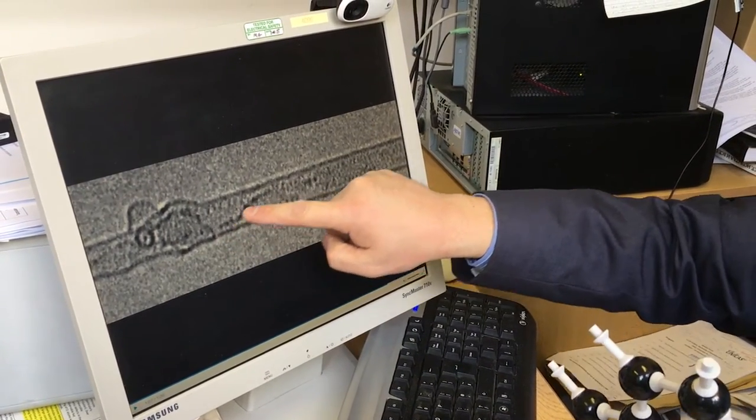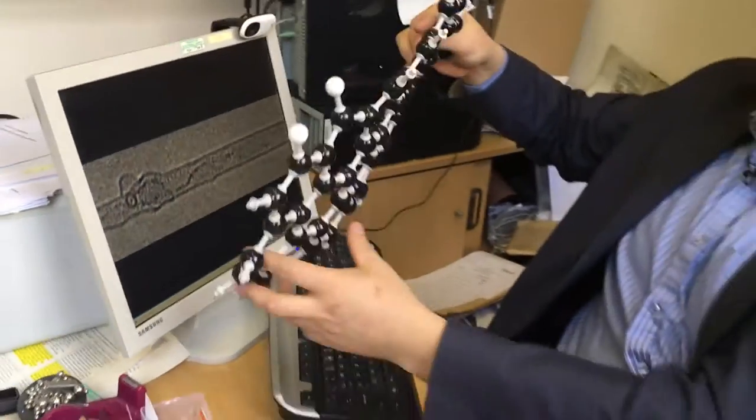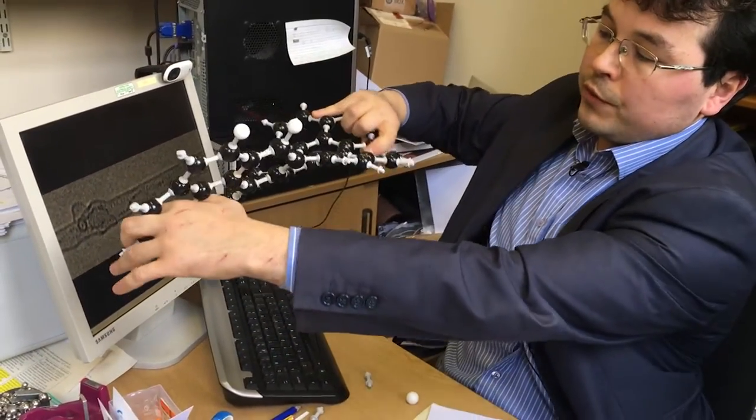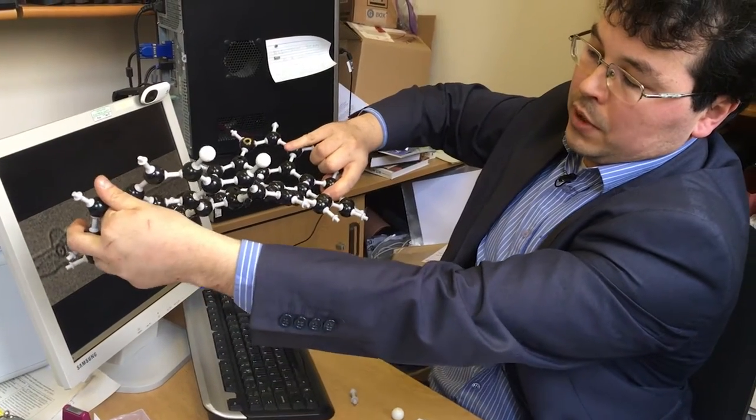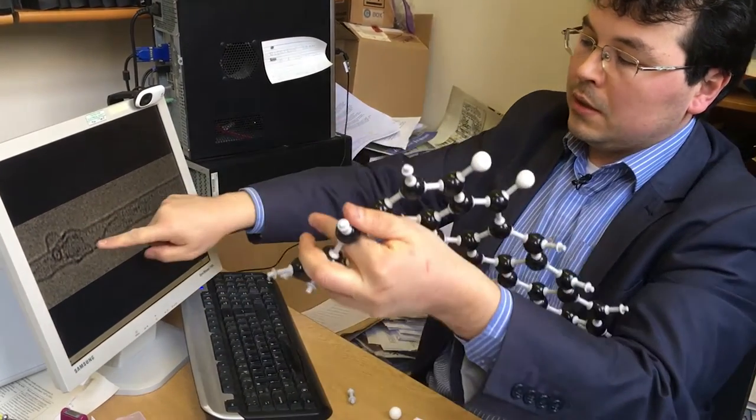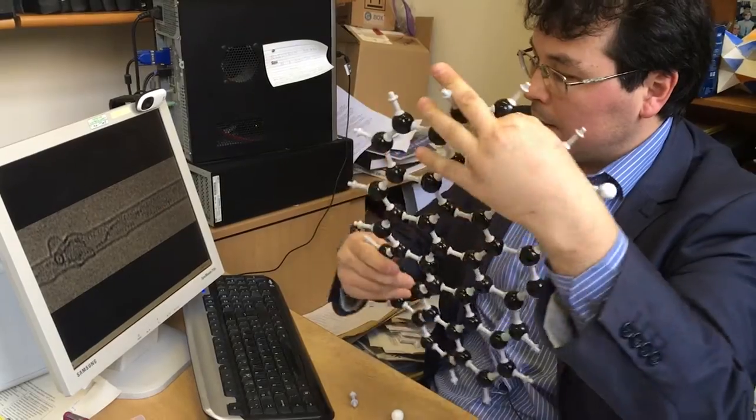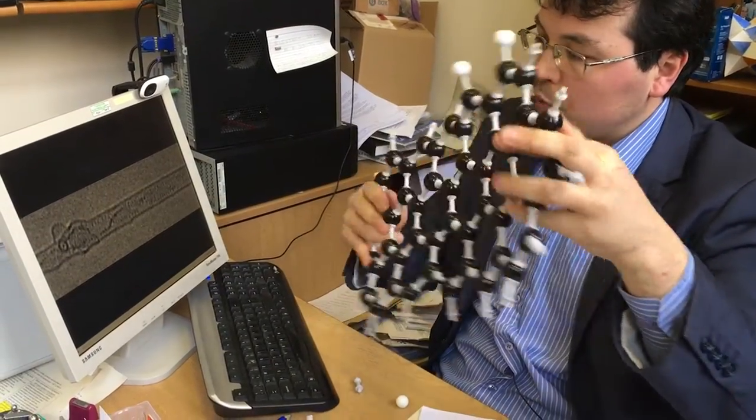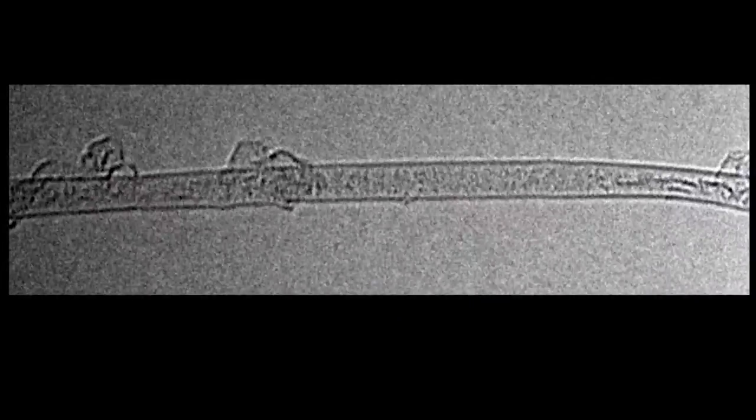You can start seeing these helical twists. And why is that? It's because the nanoribbon structure is fairly soft. So any distortion sort of this way appears as a dark line twisting within the carbon nanotube over time. That is the direct indication that they are forming graphene nanoribbons in the nanotube.